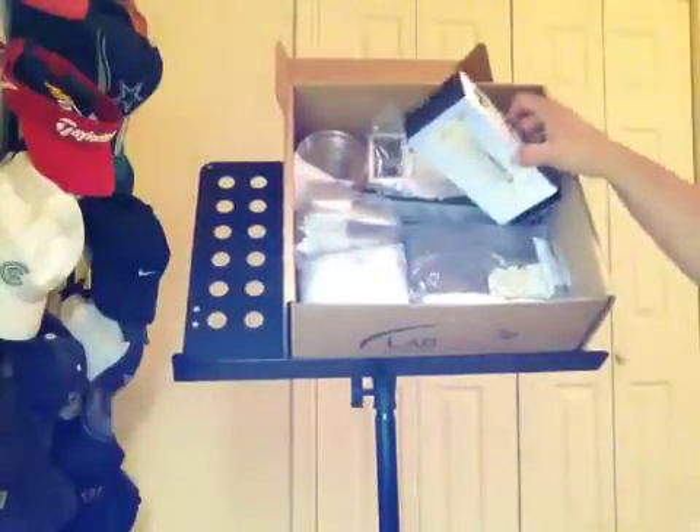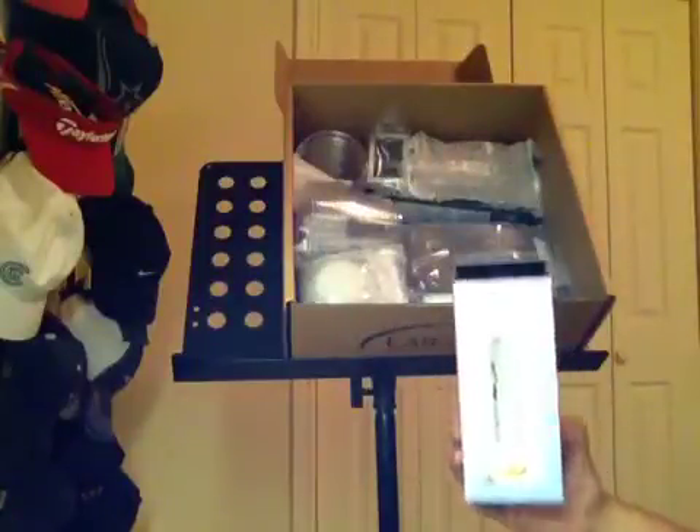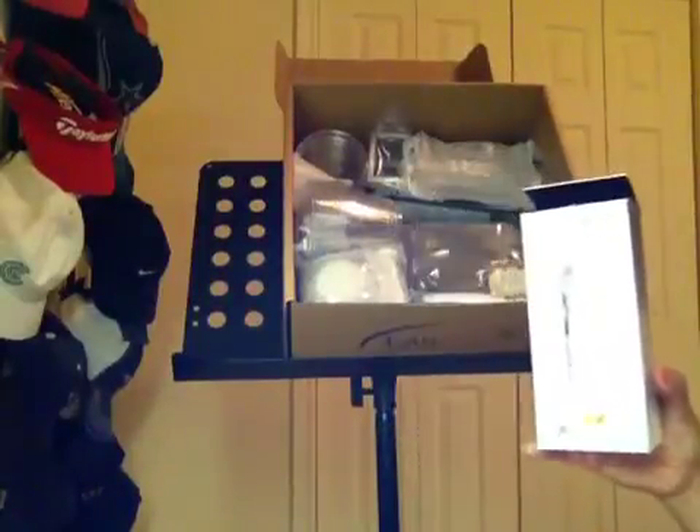Another item in your kit — believe it or not, your kit includes a microscope. This doesn't look like the traditional microscope you'd expect to see in a laboratory, but this is a modified student microscope. I'm going to open it up real quick. It's kind of cute actually. So when you're looking through your list and you're like, where's the microscope? It's this guy right here.